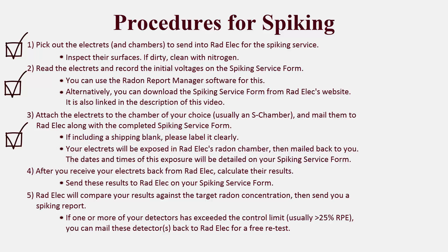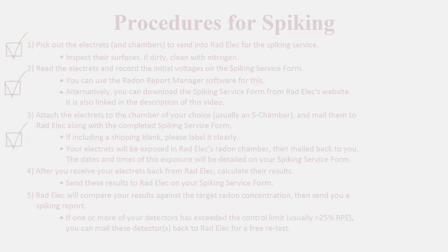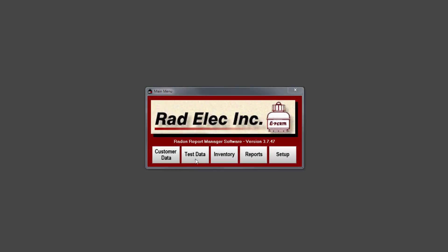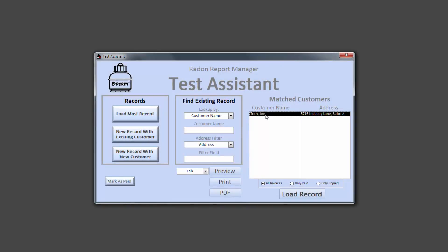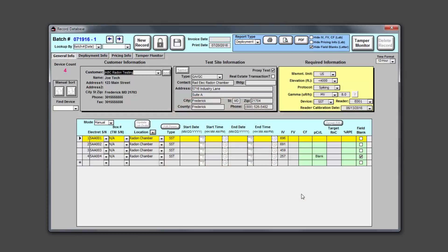After you receive them, it's time to read their final voltages and calculate the results. We'll again be using the Radon Report Manager to analyze our detectors. From the main menu, click on the Test Data button. When the Test Assistant opens, select your spiking record from the list and then click on the Load Record button. Now our spiking record is loaded, but it's also currently locked. So let's unlock it and then begin to enter in the dates and times that were written on our spiking service form. We can use the Fill Down button to expedite this process so that we don't need to type in the dates for each detector.